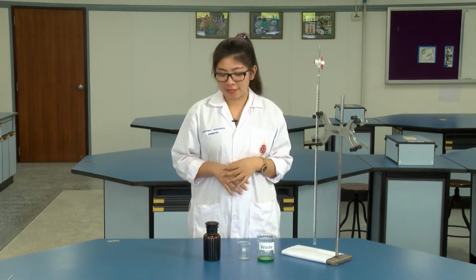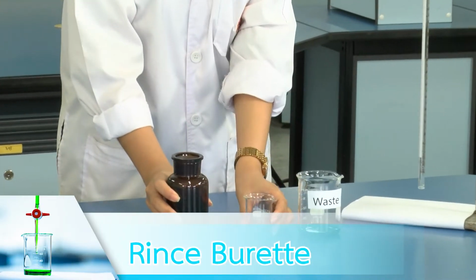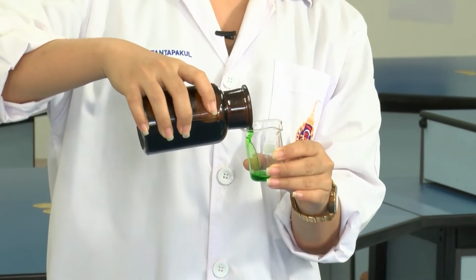For the first step, we need to prepare a standard solution. First of all, we need to rinse the burette using a standard solution.